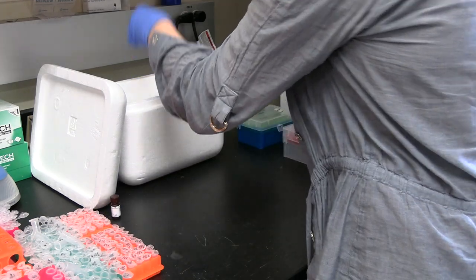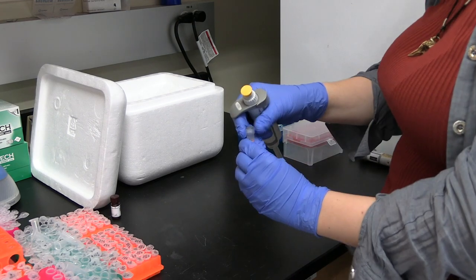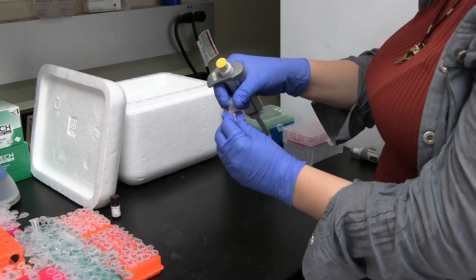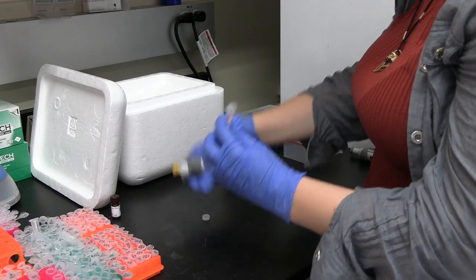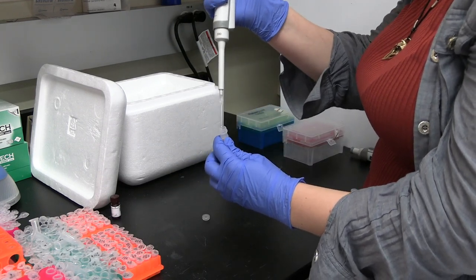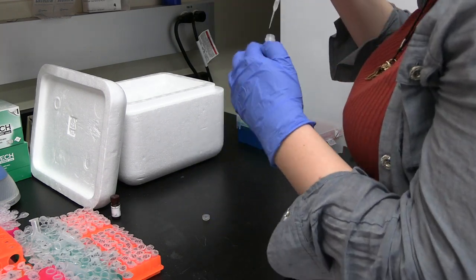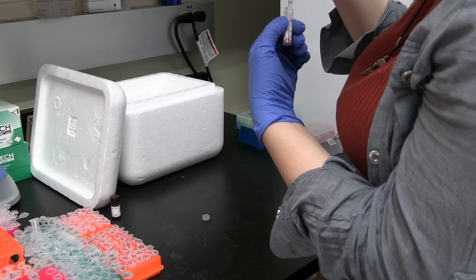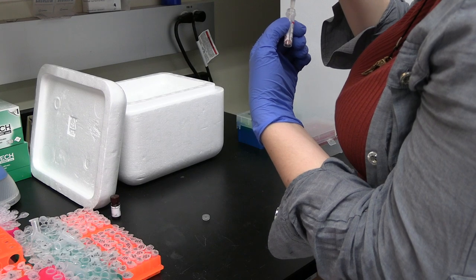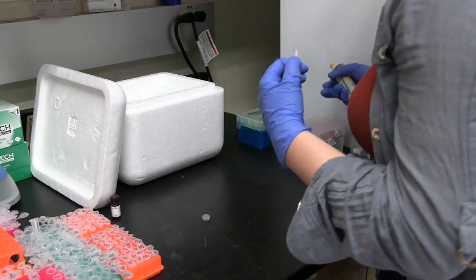Okay, I'm going to take my Atto 488 phalloidin here, open it up carefully. Shouldn't really be any powder around the rim, but if there was, I would try to pipette kind of slowly around to make sure I get all of the powder into the solution. Okay, I just add... Make sure I get the full volume out of my pipetter. Dispose of that trash.